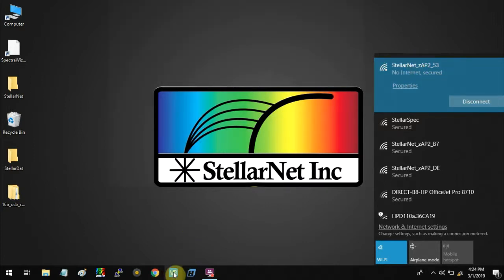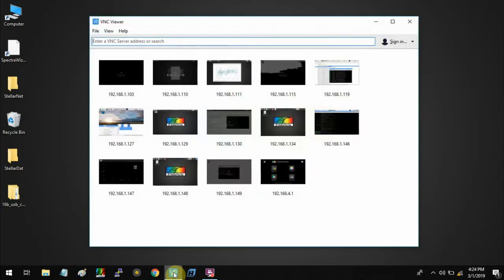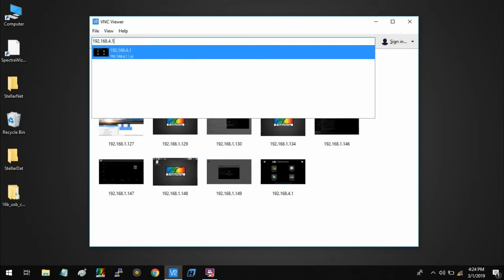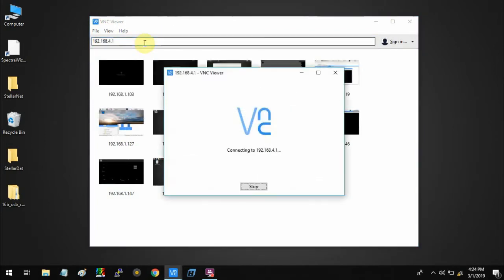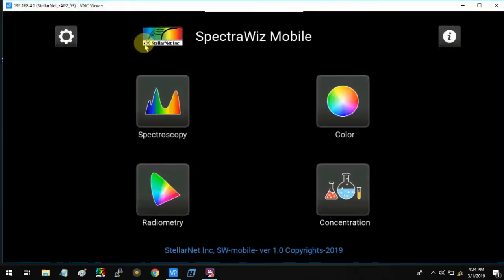Now I'm going to open the VNC Viewer and enter the access point IP, which is 192.168.4.1, and click enter.